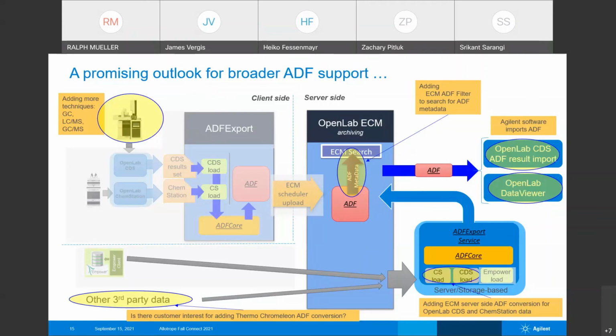What we can show short term is that we can re-inject ADF data into OpenLab CDS again and use this as a viewer, but also for reuse, which is the next block we are addressing, reuse and exchange of data, which makes complete sense to bring converted ADF data back to OpenLab systems, but also thinking of having a discussion about a data viewer.